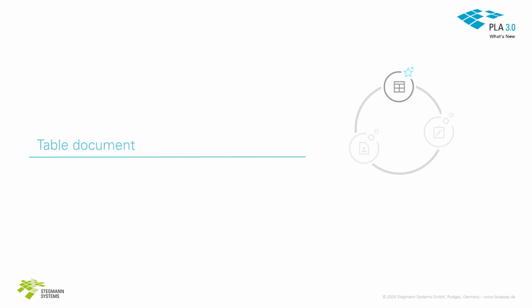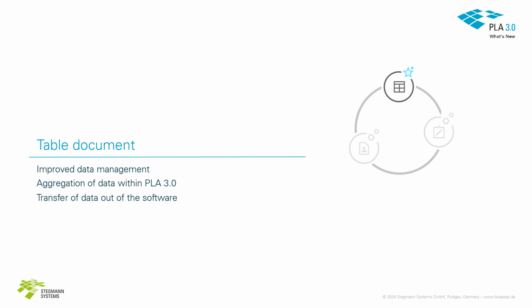Let's now look at the new features of the Generic Document Types version 2. The new table document improves the data management capabilities, from aggregating data within PLA, to transferring data out of the software.